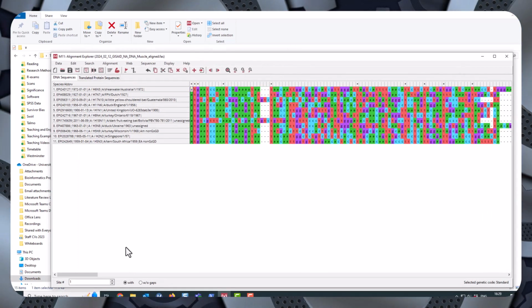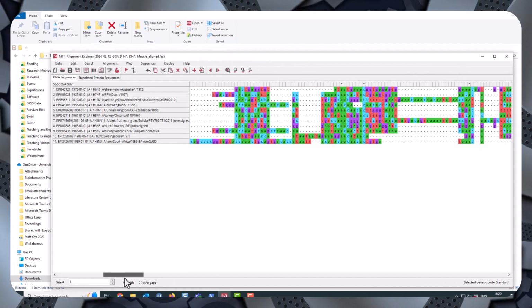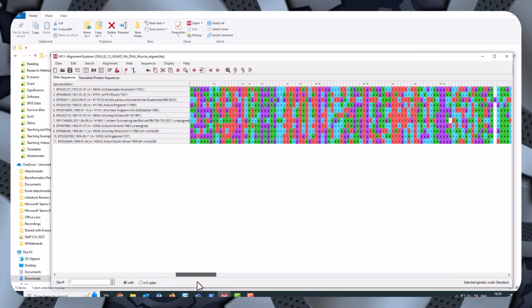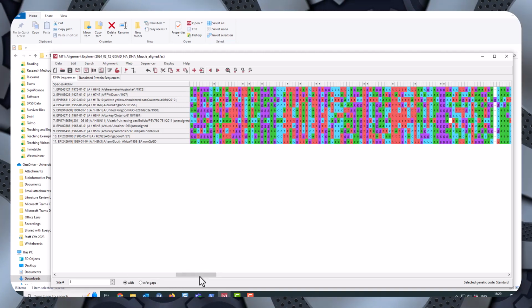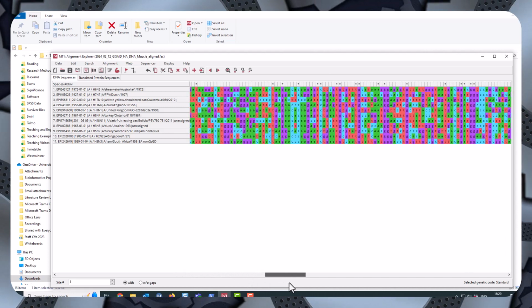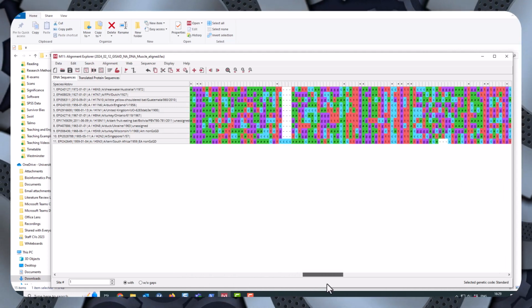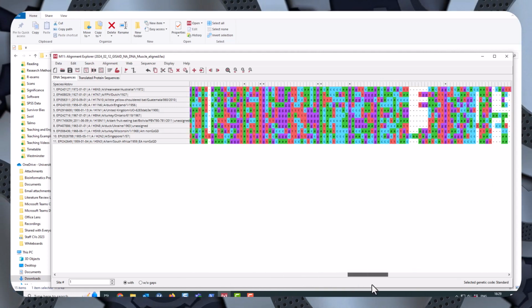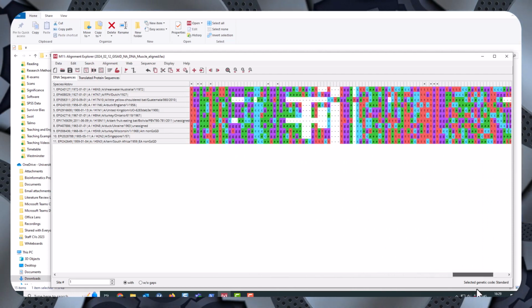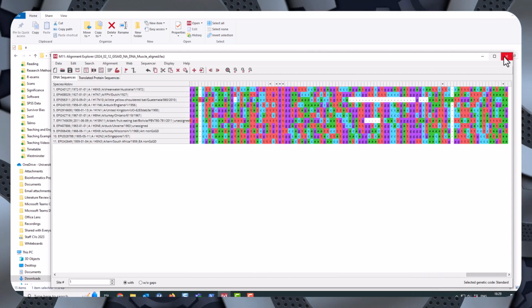You can see from opening the file in Mega that there aren't many nucleotides that are completely conserved in all of the sequences. This first file was the alignment with muscle. There are quite a lot of gaps, and some of them are a single nucleotide, which indicates a poor alignment. However, we need to look at the clustal omega alignment as well, for comparison.